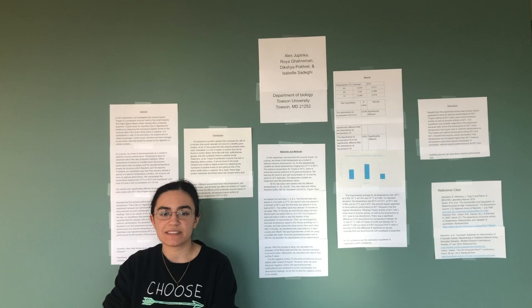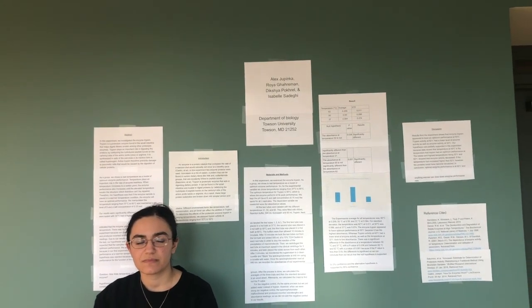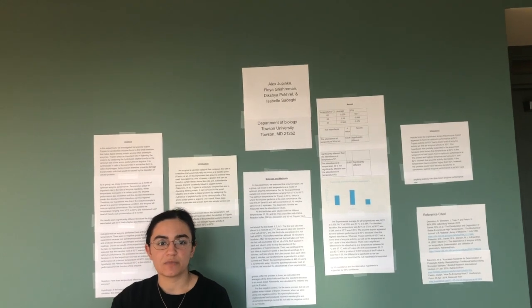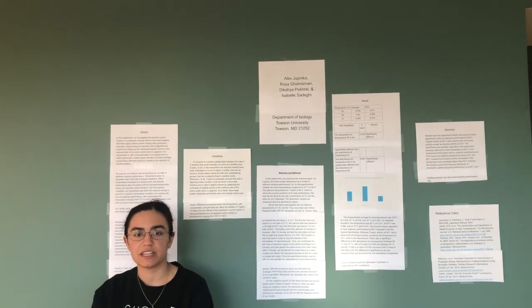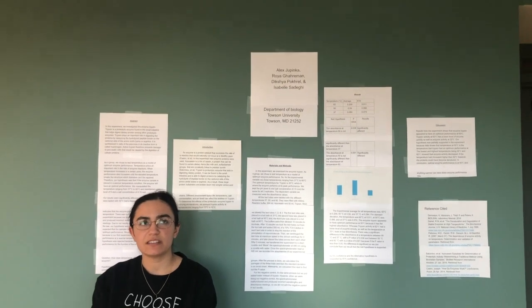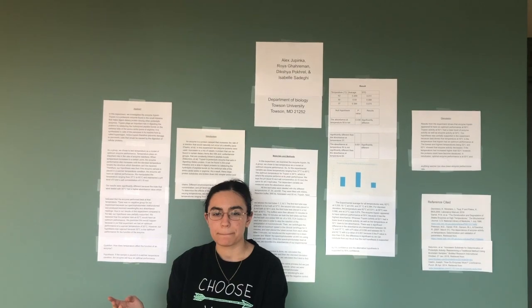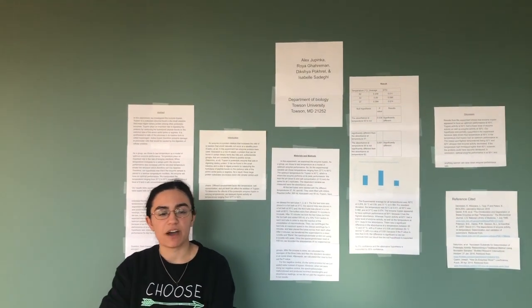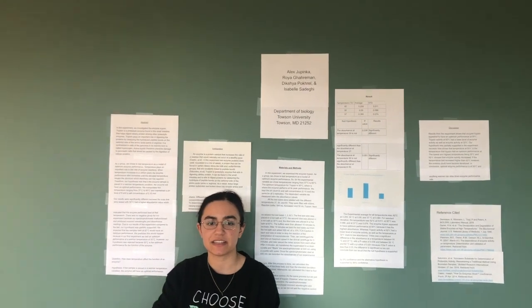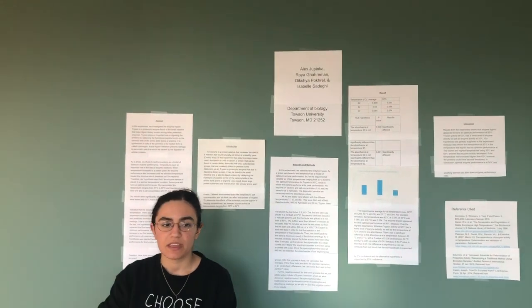And trypsin is active in conditions where it's found in the small intestine and it helps digest dietary proteins. It is found in neutral pH. Our question is, how does temperature affect the function of an enzyme?